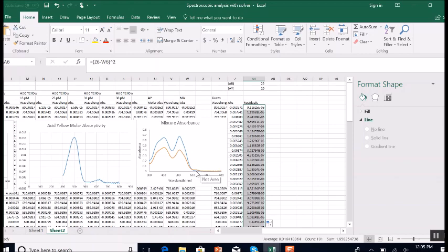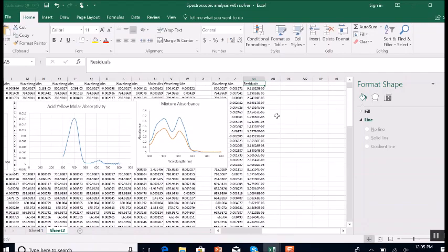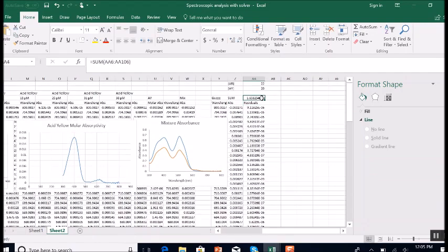So the best way to use the residuals would be to sum them all together. So that's what I'm going to do. I'm going to sum the residuals together. And that number, the sum of the residuals, should get smaller as these two graphs get closer together. So I'm going to start playing with these and see if we get smaller. Right now our residuals is 1.65.